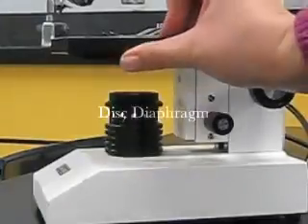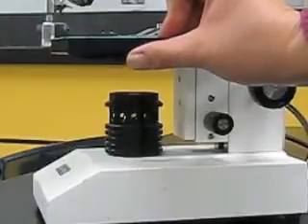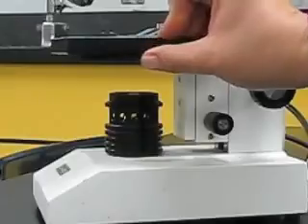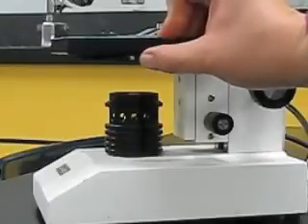The microscope's disc diaphragm is found directly underneath the stage. Rolling the circular disc underneath the stage allows for the user to determine how much light is going to come through the microscope and into their specimen.